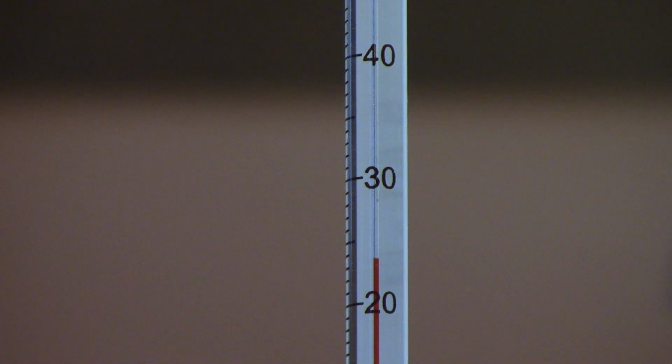So I'm going to say 23.9. You don't have to record this value yet. I'm just telling you the temperature. Whatever temperature I get to, it has to be recorded to the tenths.